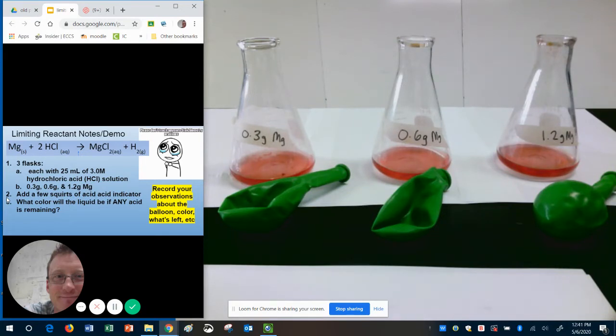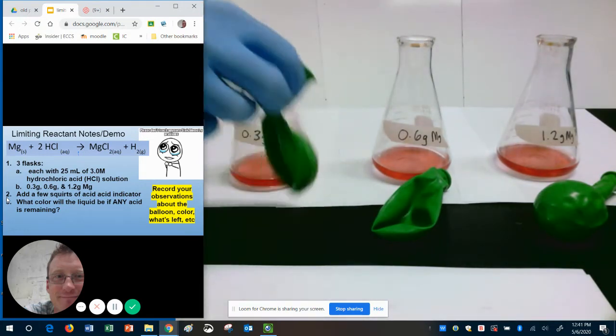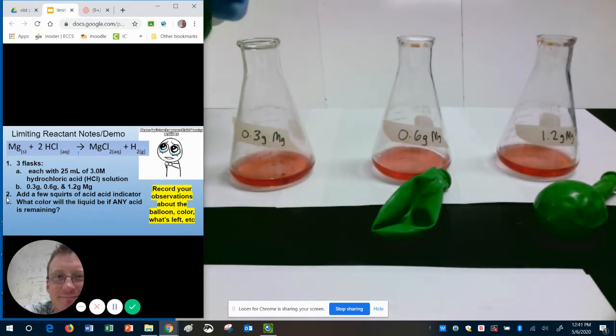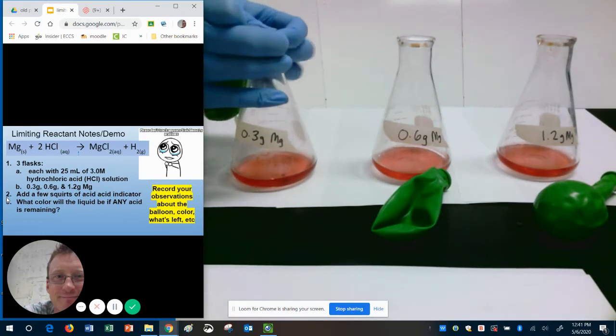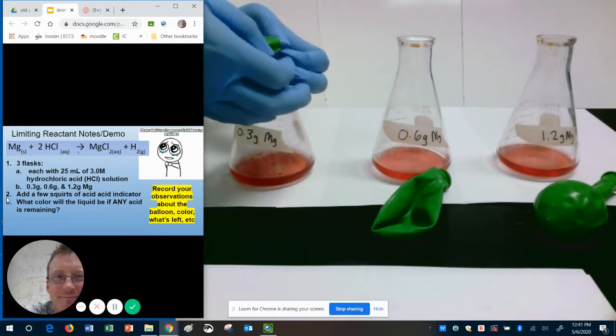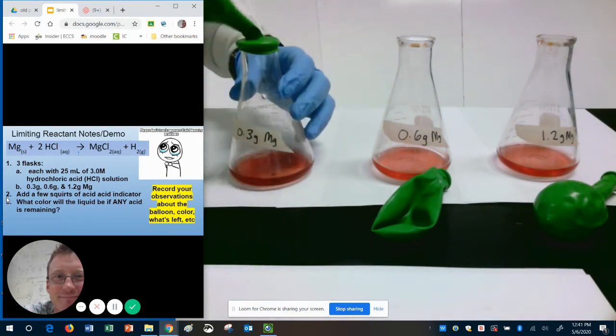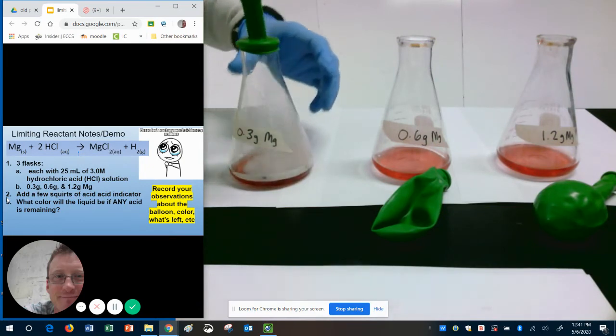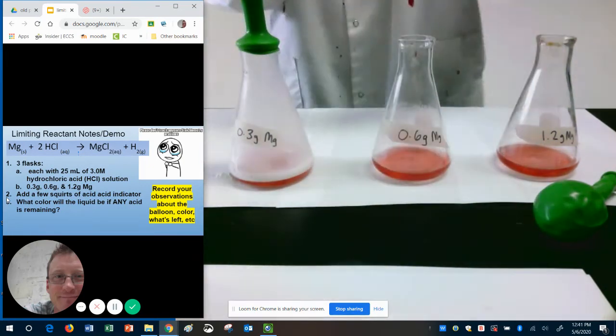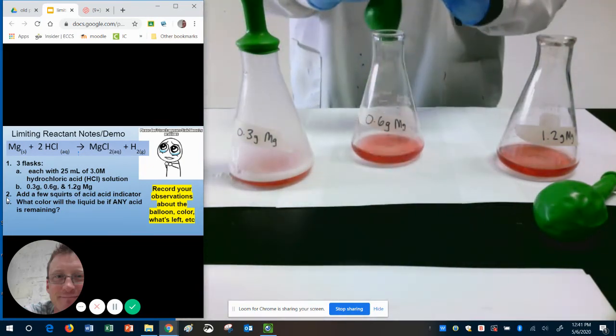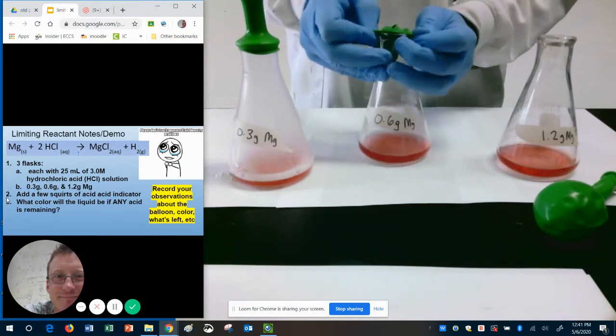Now, I already have the magnesium powder. I put it in the balloons. One, I'm using balloons because it'll trap the gas. Two, it's an easy way for me to add the powder without making a huge mess. So here's the first one.